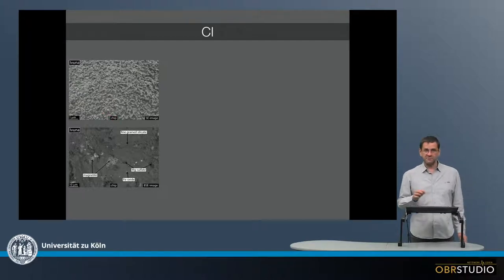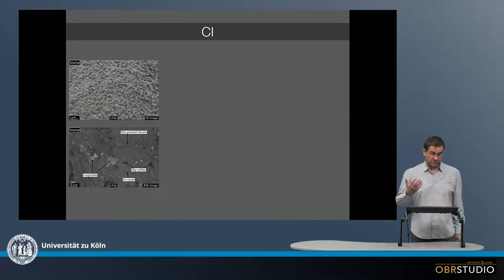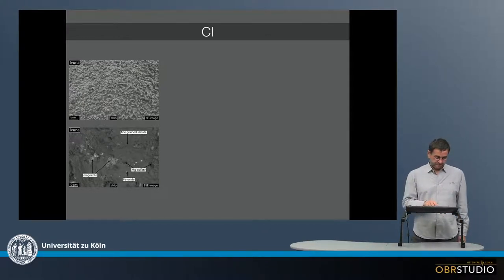Now this here is a chip, chip always means it's a little bit broken. There's a lesser magnification here, again a chip, and then we often find these nests here of magnetite, sometimes there's iron oxide, and all the rest here is fine-grained silicates.